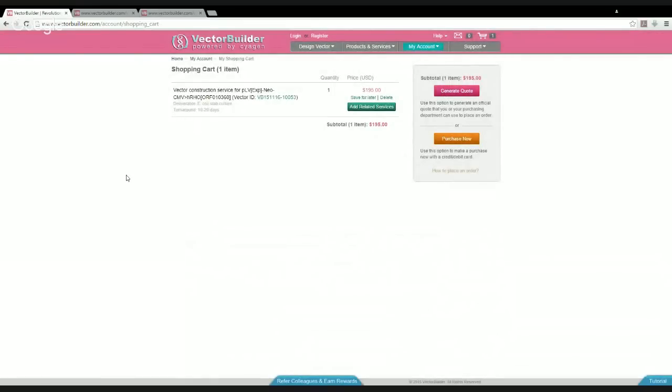Here you can review your order and all secondary services prior to checking out. And when you check out, you have two primary options. You can purchase now and pay with a major credit card, or you can generate a quote. Once you've generated a quote, this will also assign you a project tracking number, which can then be used in conjunction with your quote ID for placing your order at a later time with a purchase order.